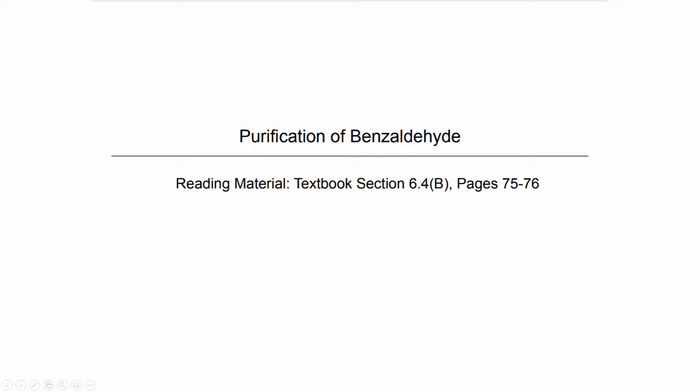All right, everyone, so this is going to be the very first experiment for the OChem lab, the purification of benzaldehyde. You can follow along with me in your textbook, pages 75 through 76, which can also be found on Blackboard.